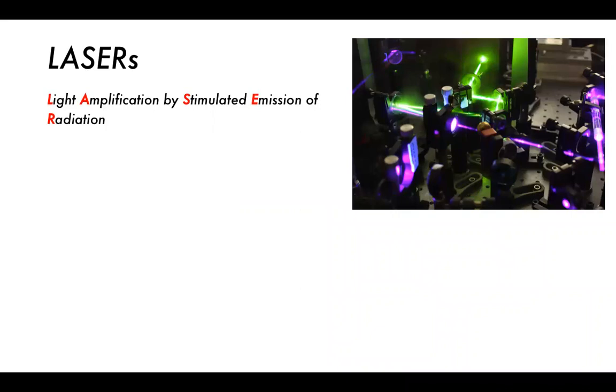Lasers we talked about, so we'll talk about very briefly here. We won't go into a huge amount of detail with these. They are reasonably complicated, but they produce very narrow wavelengths of light, and they're very, very reliable in terms of their energy output, consistent for hours and hours on end. If you've set it up correctly, you'll get the same energy output basically forever, so long as you have enough power and you have enough cooling and things like that. So laser stands for light amplification by stimulated emission of radiation. You don't need to remember that. You just need to remember that they're called lasers, but it does actually stand for something.